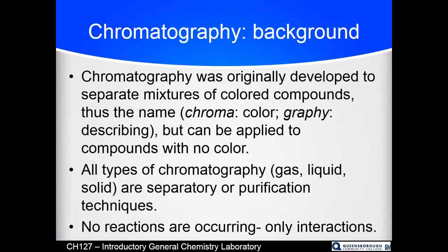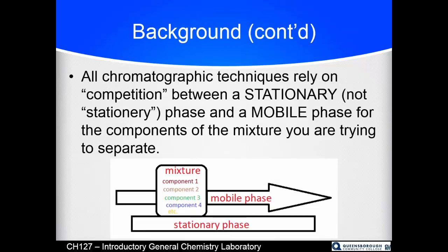If you have a chemical reaction occurring, you are not performing a chromatographic technique. You are doing a chemical reaction, and that is something different. So the way that it works is you have a mixture, shown here.